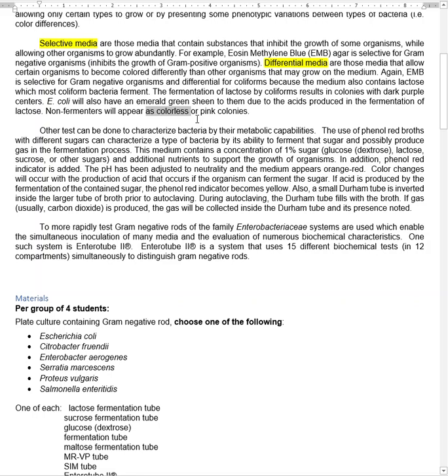Okay, now metabolism, and this is going back to these. We also have tubes which contain sugar. Got some that have glucose, some that have lactose, some that have sucrose, all different kinds of sugars. We usually use about 4 different kinds in the actual lab. And that's a liquid culture with the sugar in there.